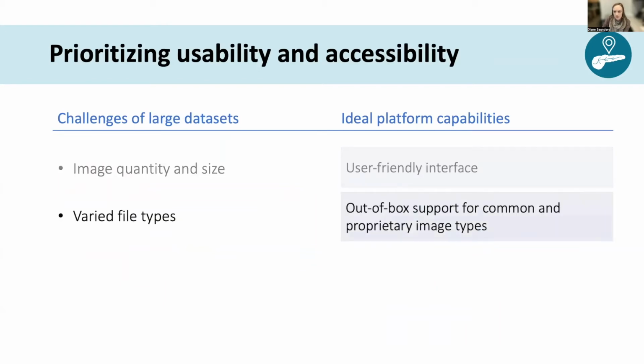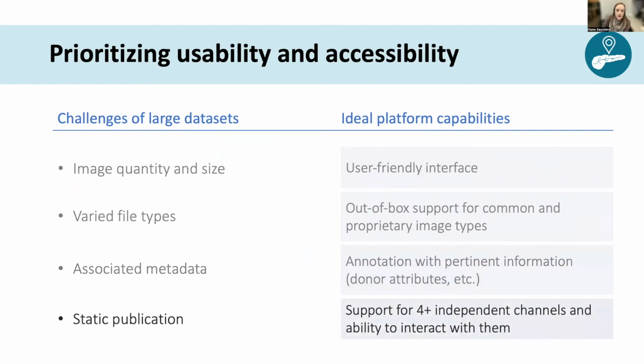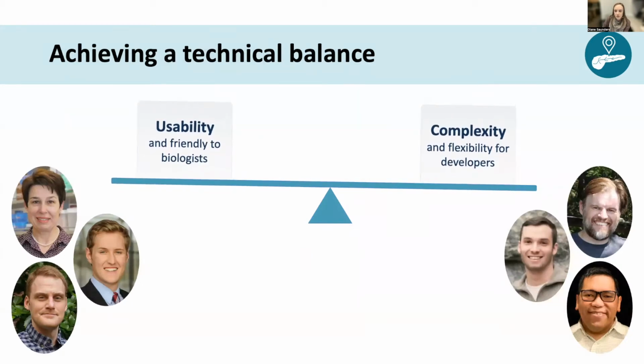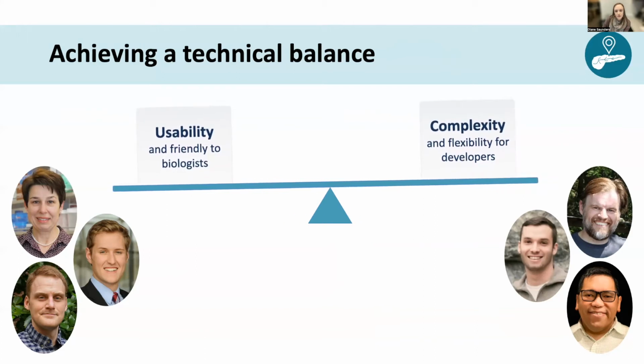We knew we would have a lot of different varied file types, and also that we wanted to annotate these images with pertinent metadata. Finally, we wanted biologists to be able to actually interact with these images rather than just displaying them in static figure panels in publications. To address these challenges, we assembled a multidisciplinary team that includes biologists, developers, and bioinformaticians.